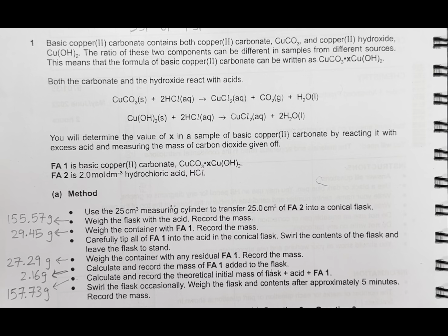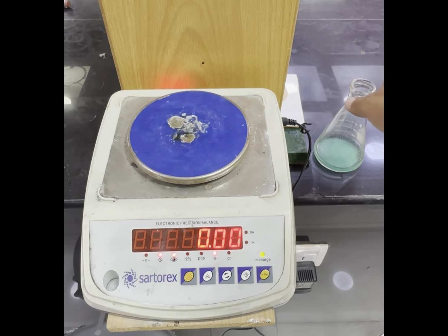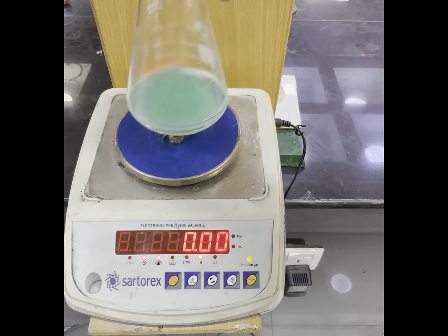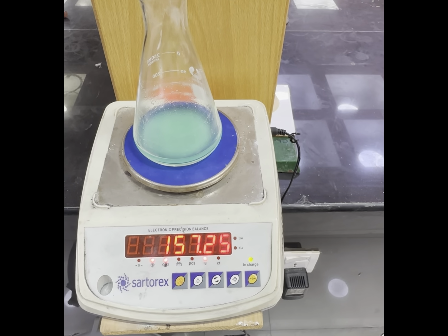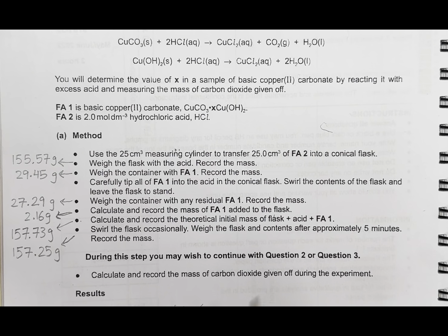Now the next part says swirl the flask occasionally, weigh the flask and the contents after approximately 5 minutes, record the mass. Now let's take the mass of the flask with the acid content remaining. Now the recorded mass of content of the flask after the reaction has finished is 157.25 grams.